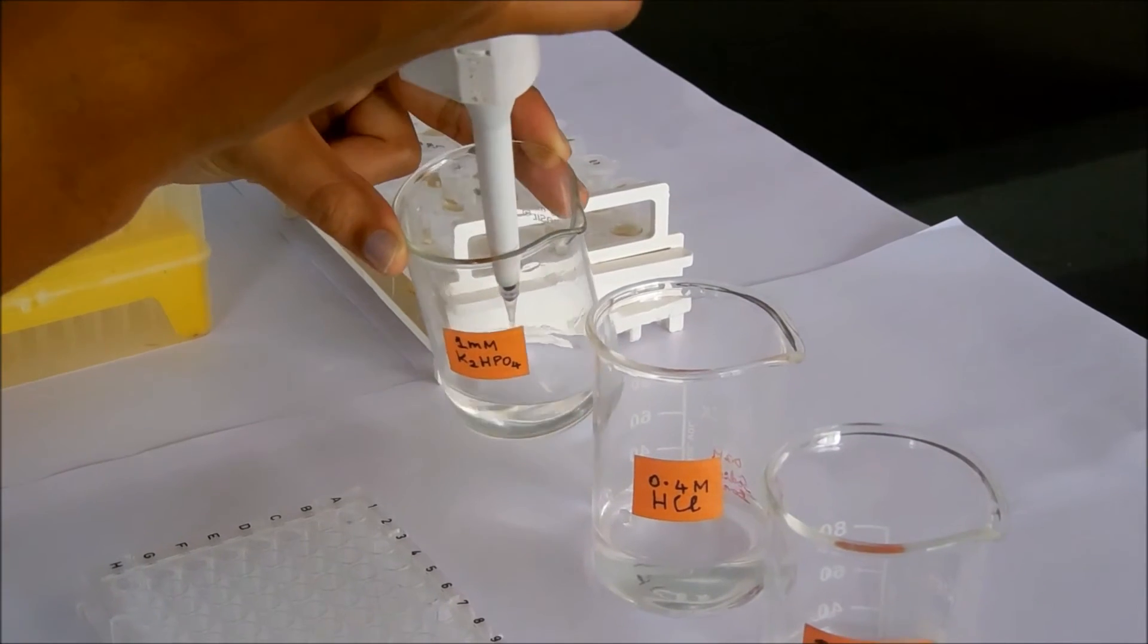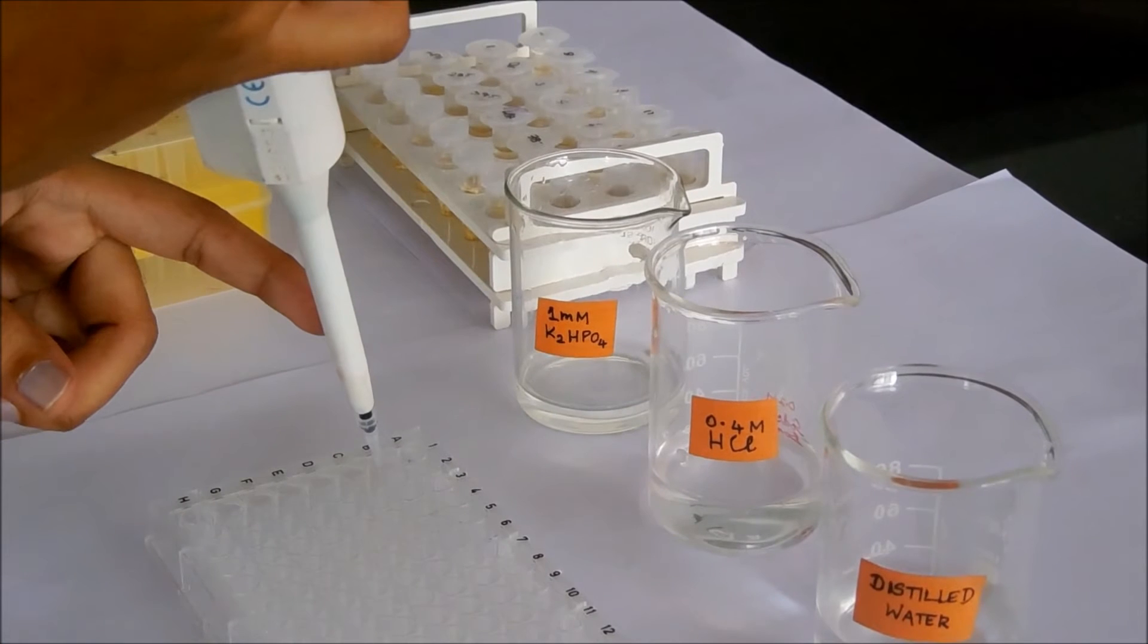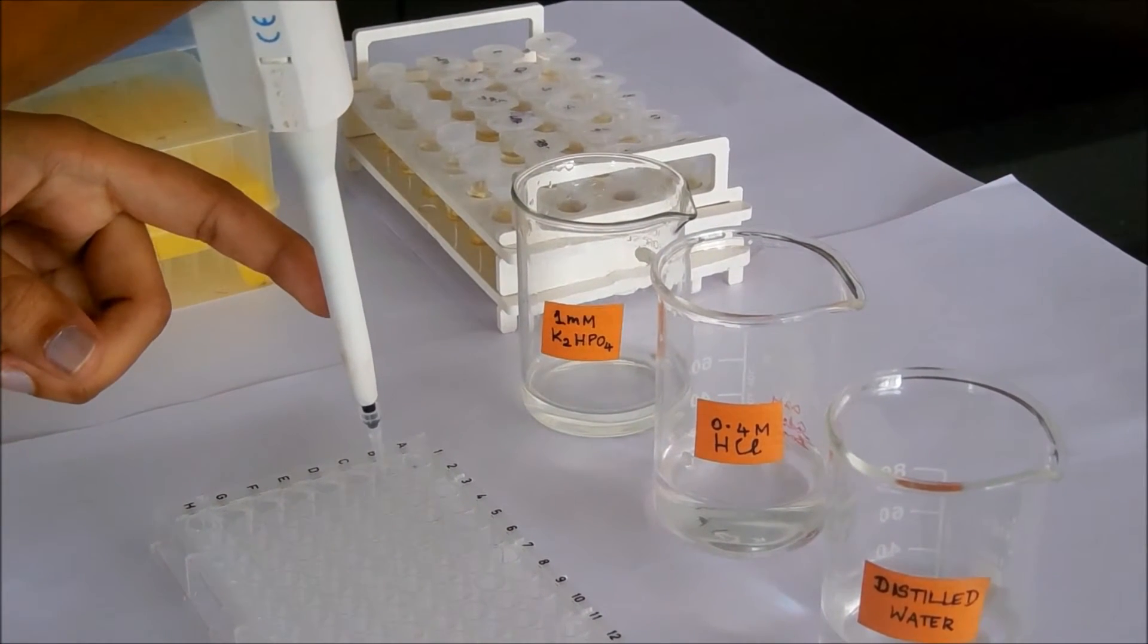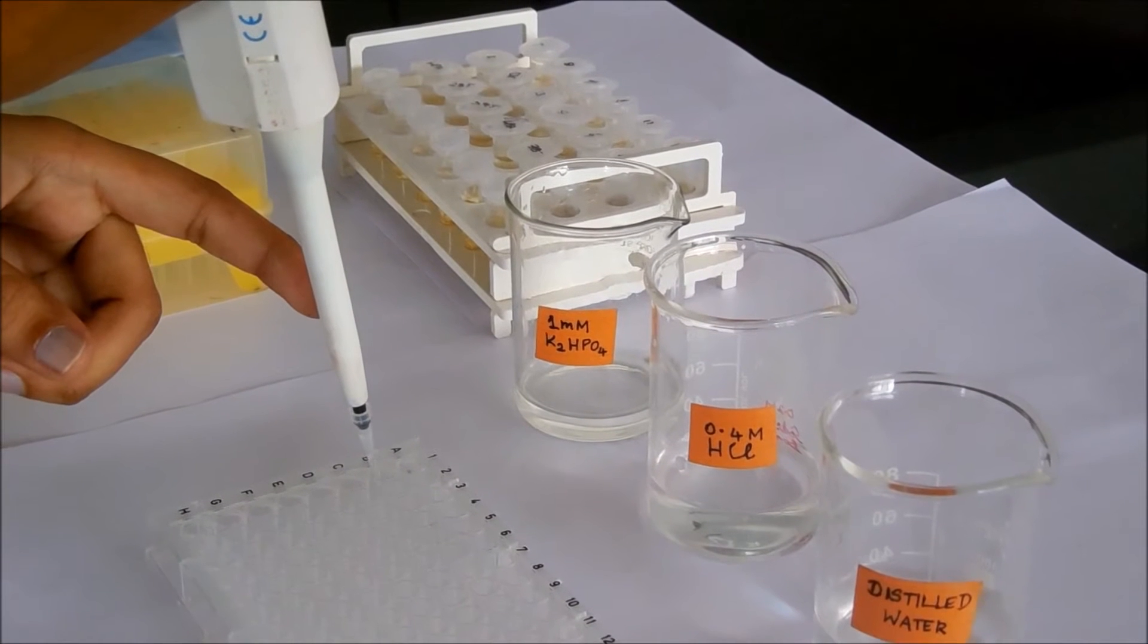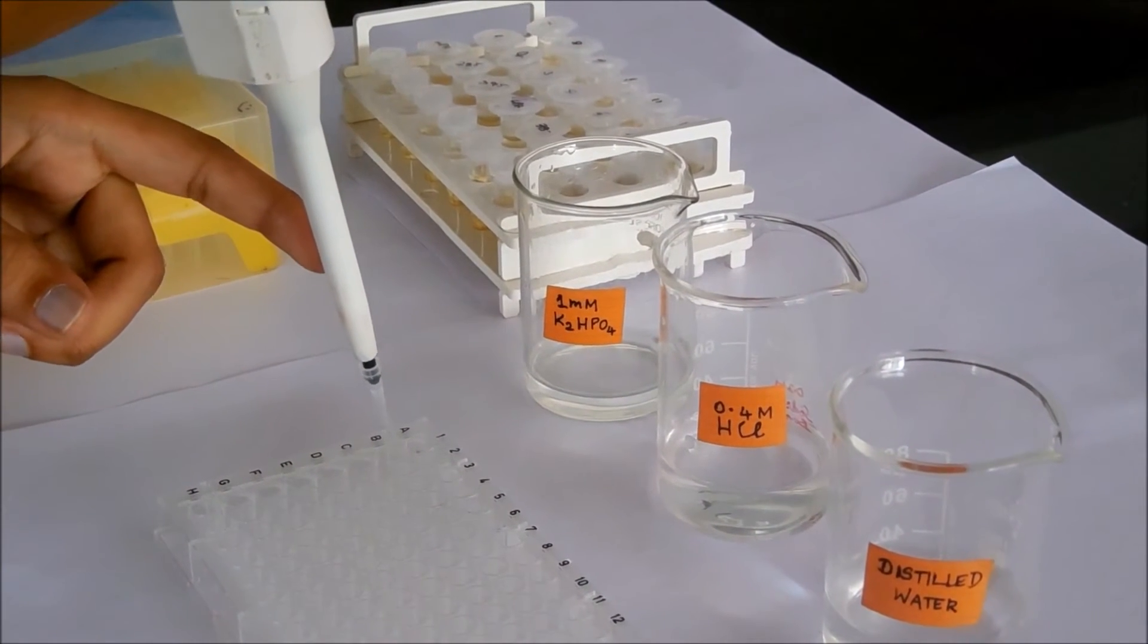For standard preparation, take dipotassium hydrogen phosphate at volumes of 0 µL, 5 µL, 15 µL, 30 µL, and 45 µL.